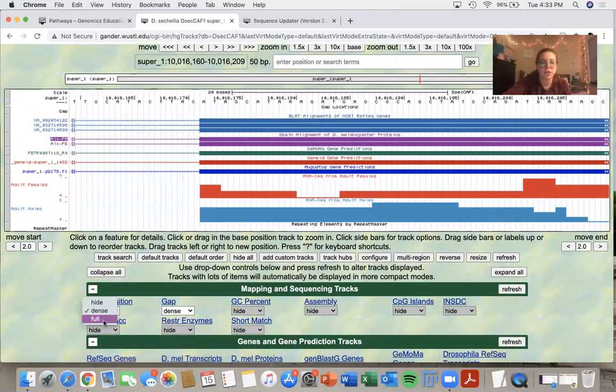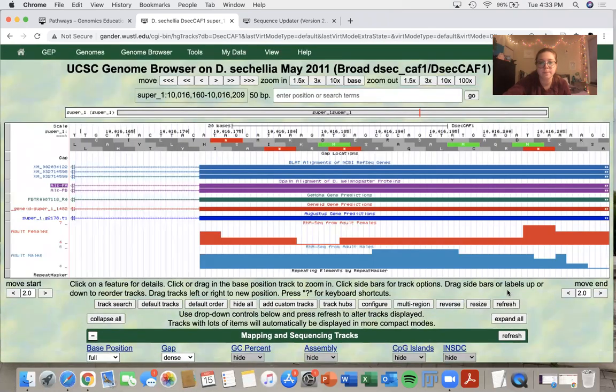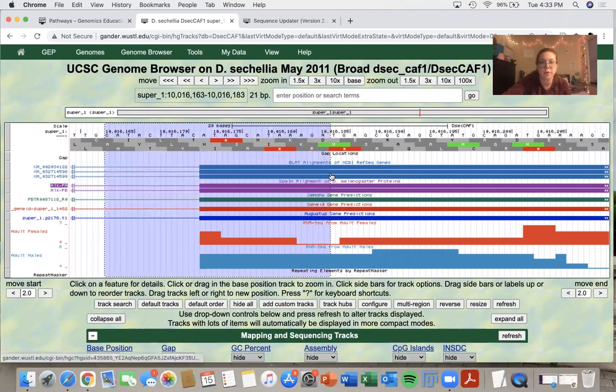And I'm going to change my base position to full and just zoom in a little bit further.